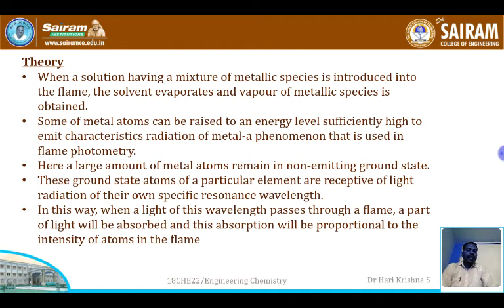The solvent gets evaporated, leaving behind the metal species. Some of the atoms can be raised to the higher energy level, the excited state, and when they come back to the lower energy level, they liberate some energy in the UV visible radiation that can be measured by the flame photometer.